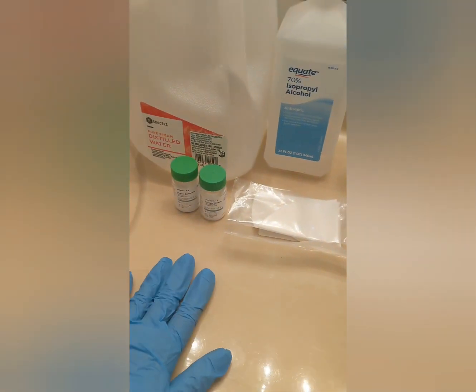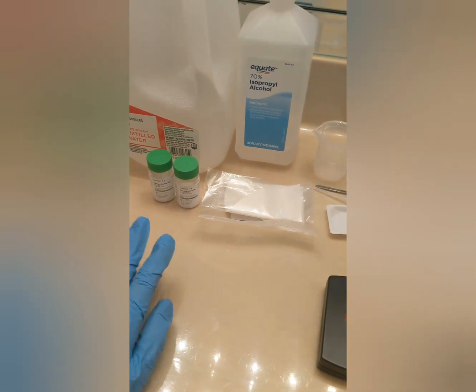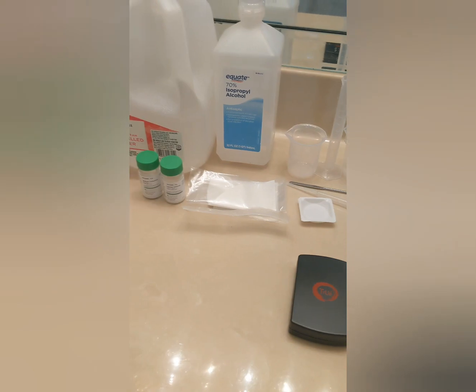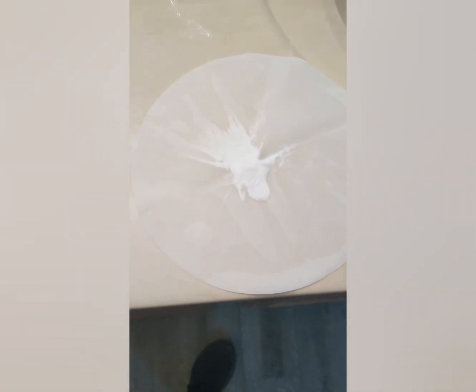It will have a label, since it is not going to be supervised 100% of the time, and then we will be able to come back and weigh that and make a conclusion about what we've done with the lab. Here's the precipitate immediately following the lab, so it will sit here to dry for as long as it needs to, and here's our label since it will be left unattended.